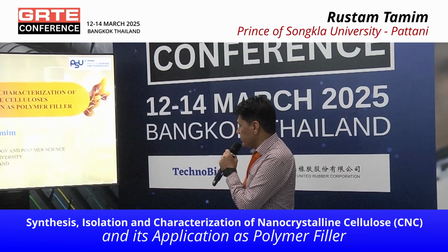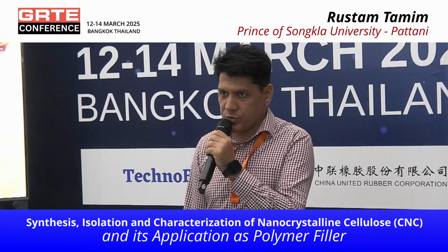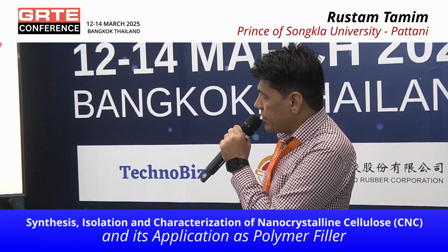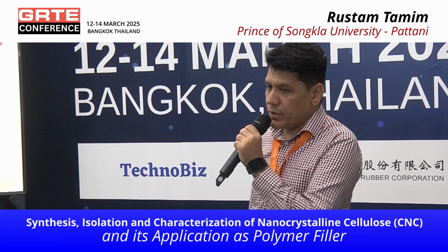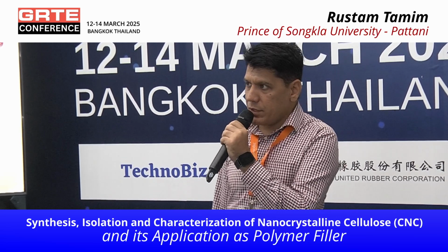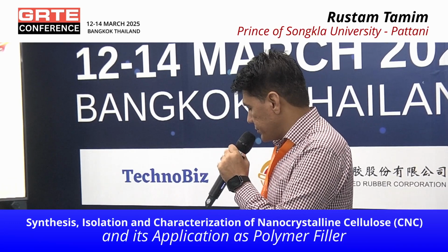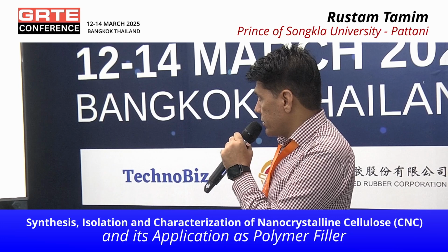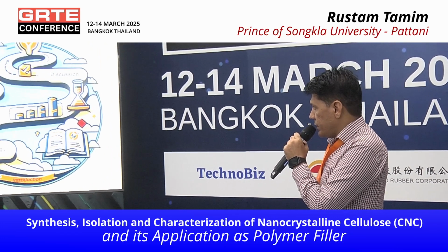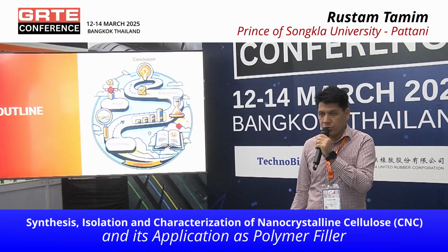I want to present a research work. The title is the synthesis, isolation, and characterization of nanocrystalline cellulose, and its application as a filler in polymer. So the outline of this work is the introduction, methodology, results and discussion, and conclusion.